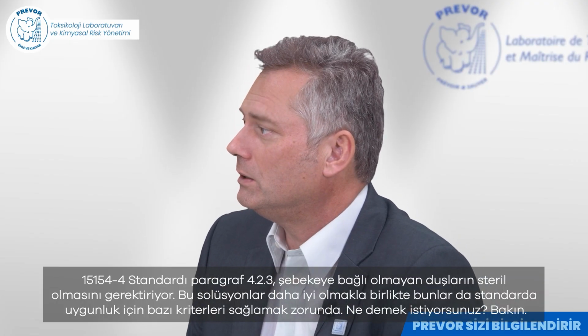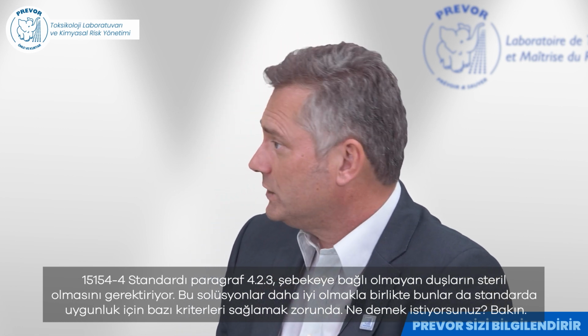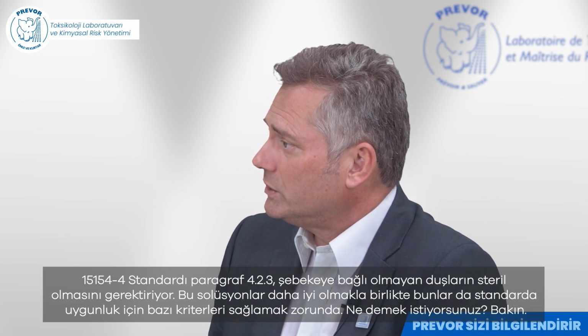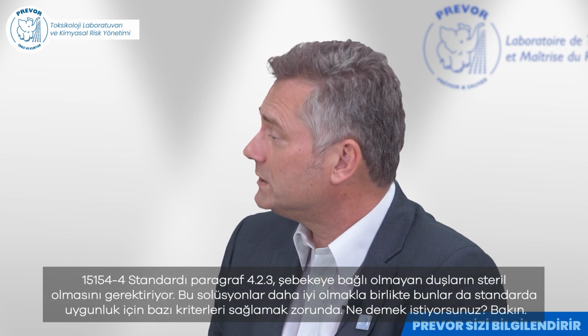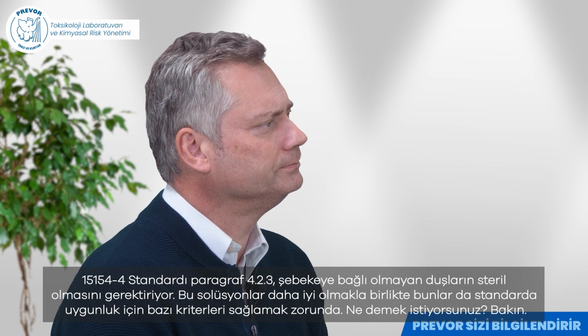Yes, I understand. I guess a lot of companies are turning to sterile solutions. The standard 15154-4, paragraph 4.2.3, requires solutions not connected to the network to be sterile. Now, these solutions represent progress, but you will see that they must also meet the criteria of the standard to be compliant. What do you mean? Have a look.